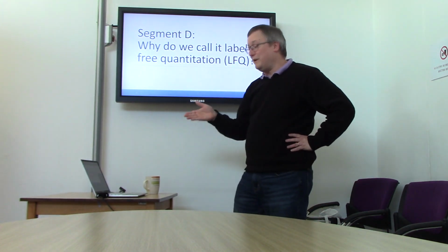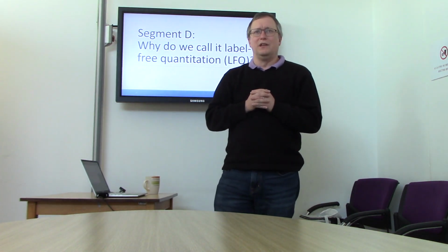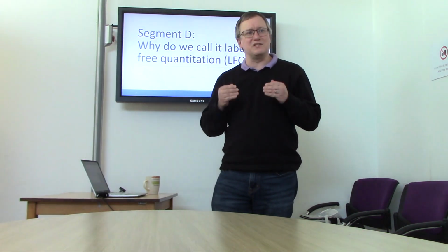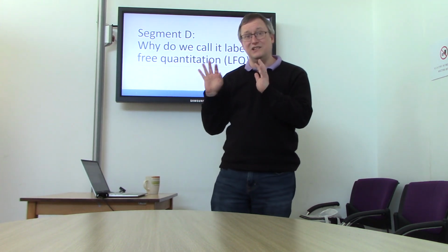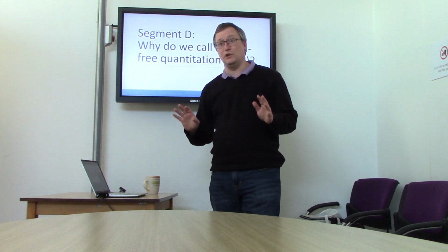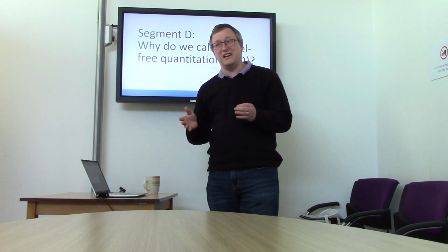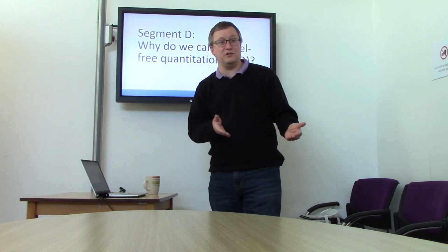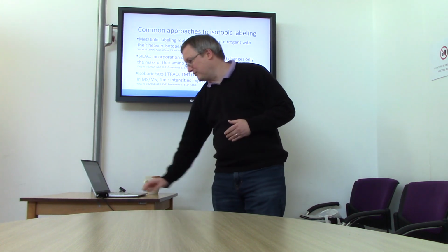So first off, why do we call it label-free quantitation, or LFQ? This segment is largely about all the stuff we're leaving out of the talk, because label-based quantitation has been commonplace in proteomics for a long time, and it's only relatively recently that most people decided that you could do viable quantitation using no isotopic labeling.